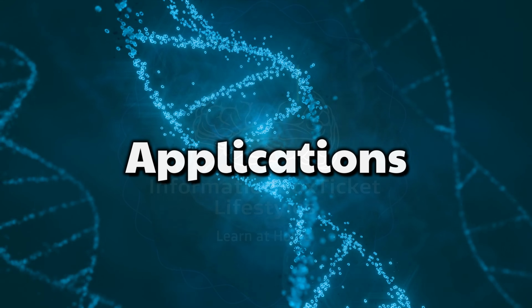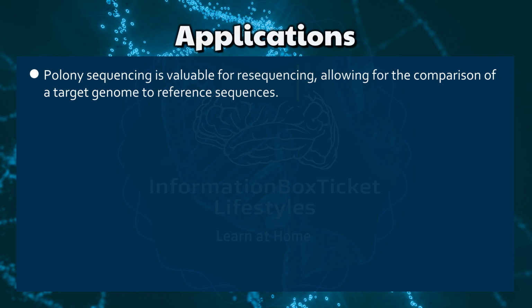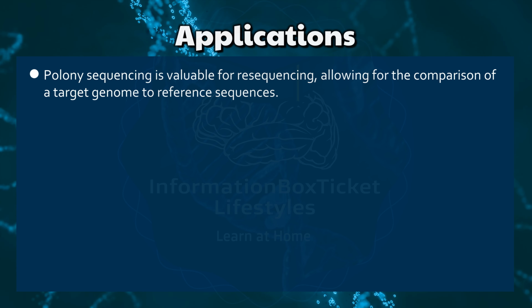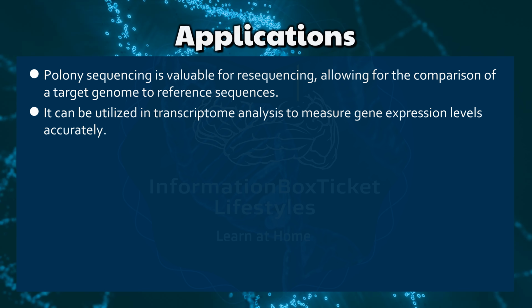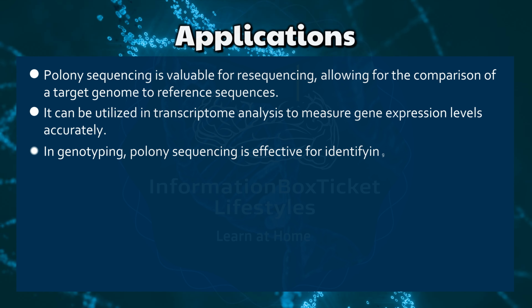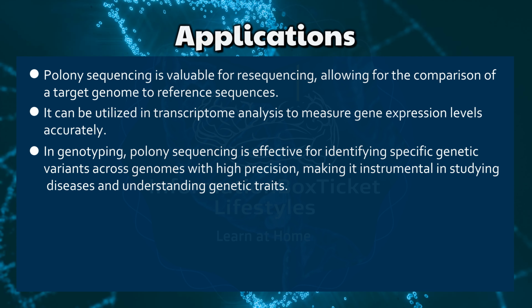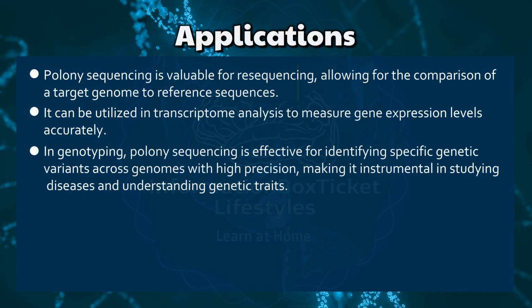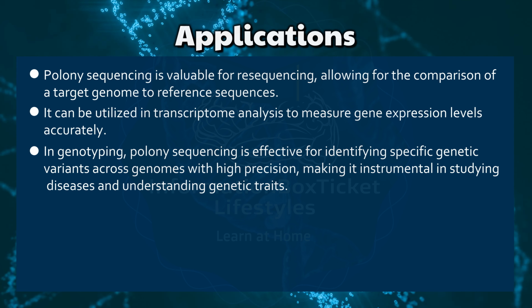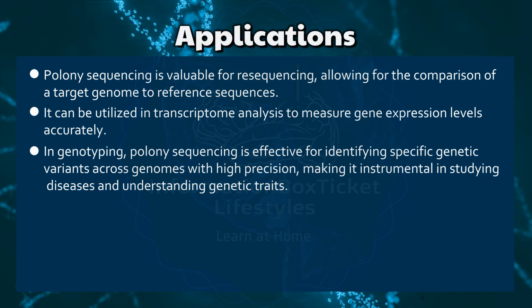Applications of Polony sequencing. Polony sequencing is valuable for resequencing, allowing for the comparison of a target genome to reference sequences. It can be utilized in transcriptome analysis to measure gene expression levels accurately. In genotyping, Polony sequencing is effective for identifying specific genetic variants across genomes with high precision, making it instrumental in studying diseases and understanding genetic traits.